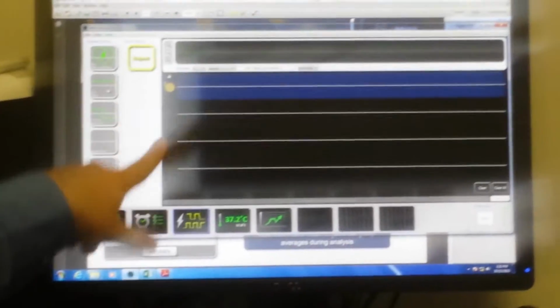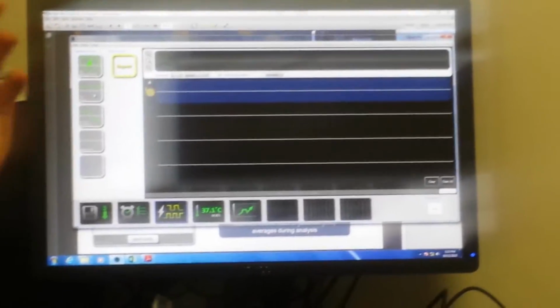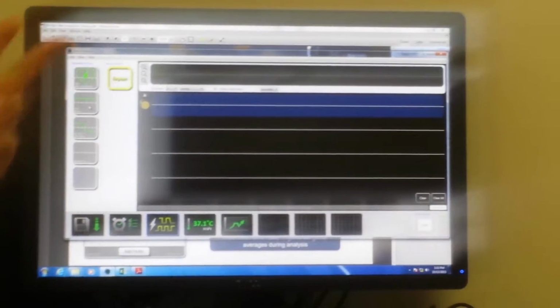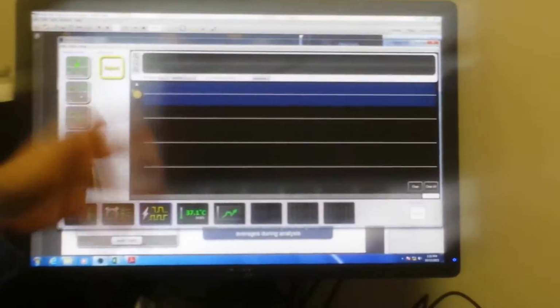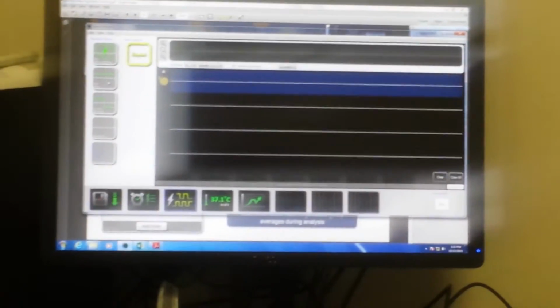You'll notice it's got A, B, C, D. This is intended. Right now, only A works. The others are placeholders in the software. We've got an upcoming stimulation update coming for Axis. And it's supposed to be out with the new light stimulation as well.